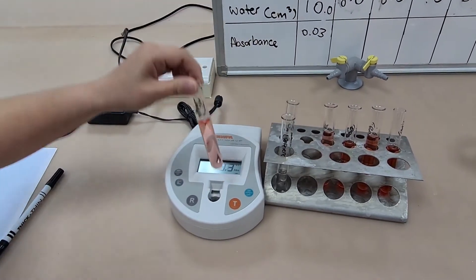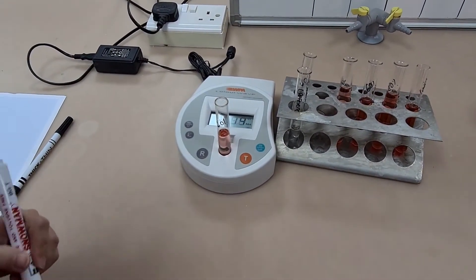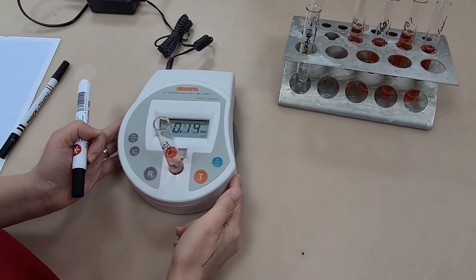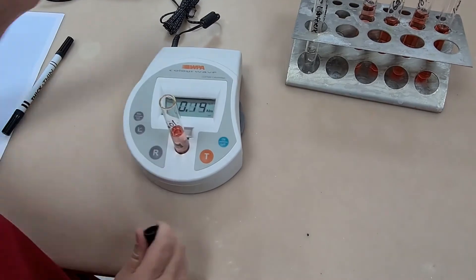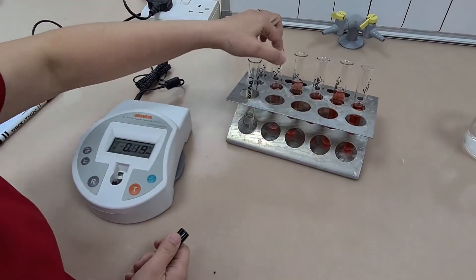Then moving on to my next dilution I can simply press T to test it, wait for a second and I take my reading from the digital screen. Then I'm going to repeat the same process with my other dilutions.